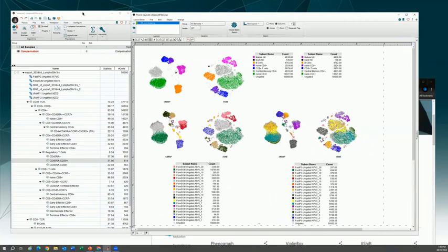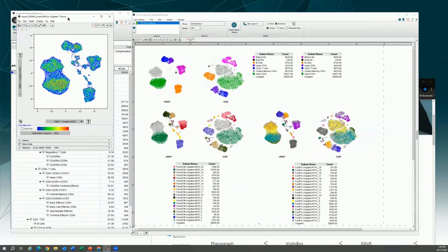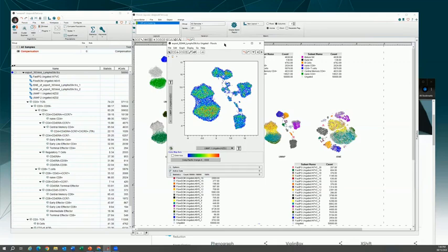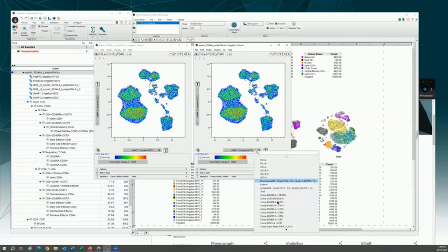So what I have here, I've already gone through and run. I downsampled just a phenotyping data set to 50,000 events, again, because I'm on this really small Windows machine. It has, I forget exactly, maybe close to 40 different parameters, but it's just a high parameter immunophenotyping panel.